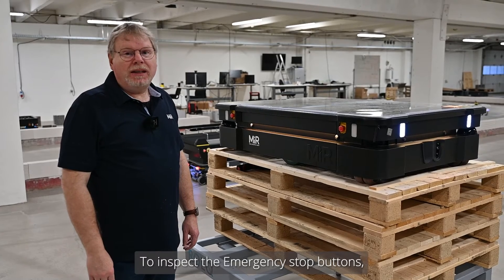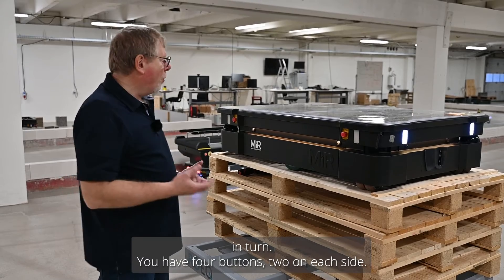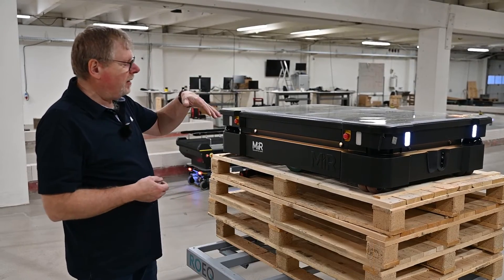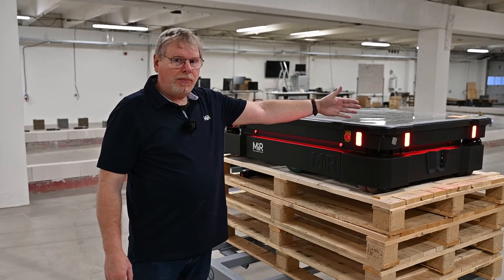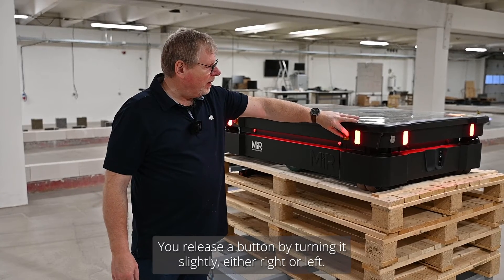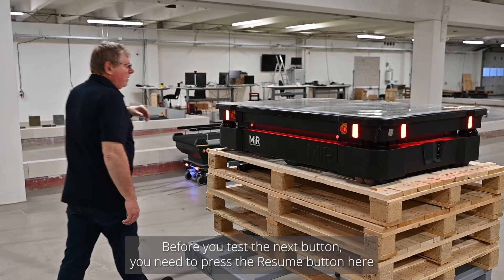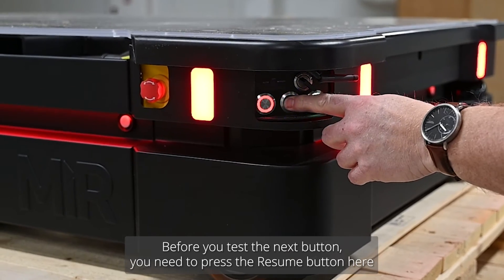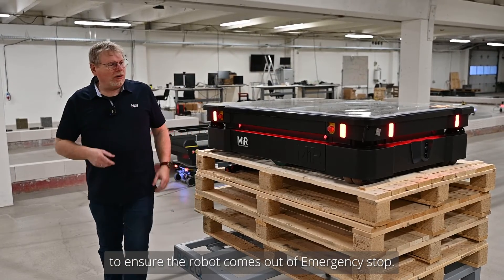To inspect the emergency stop buttons, you need to inspect each of them in turn. You have four buttons, two on each side. Press a button — the robot goes into emergency stop. Release the button by turning it slightly either right or left. Before you test the next button, press the resume button at the rear left to ensure the robot comes out of e-stop.